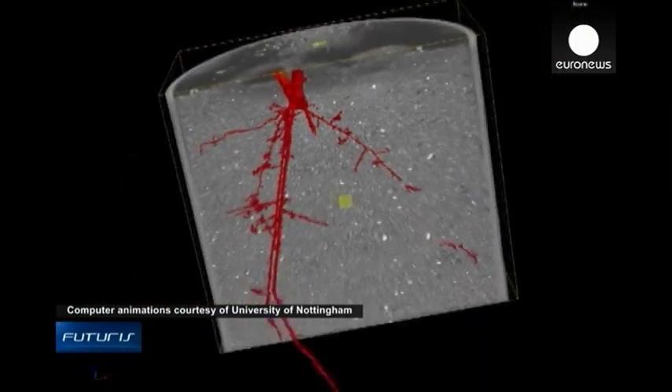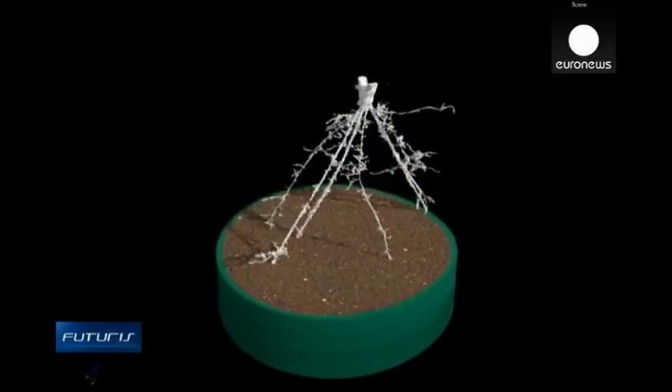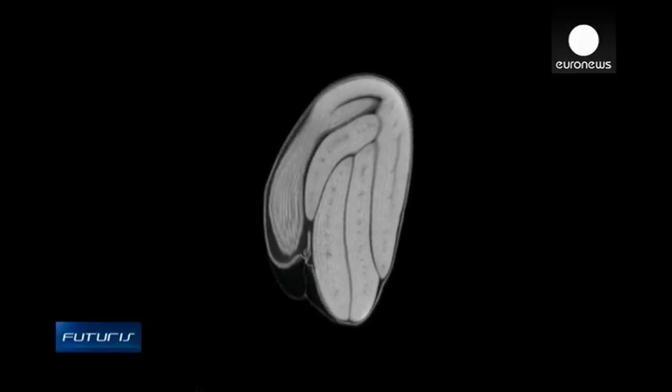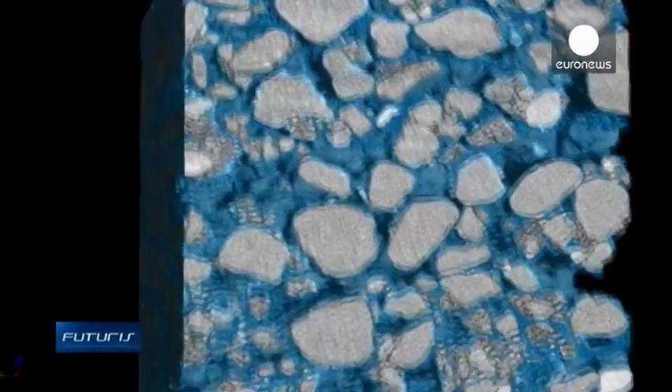The images obtained with the scanners help to create computer models that accurately reproduce how roots grow in different soils and moisture conditions underground. We're now looking at multiple roots in the same image and trying to separate those so we can look at the way they interact with each other in the ground. We can get a sequence of images and use that to look at how the root grows, analysing the image to find out where the water is, where the air spaces in the soil are, so that we can study the interactions between the soil structure and the way the root grows.